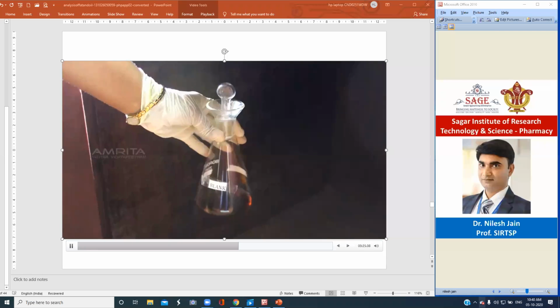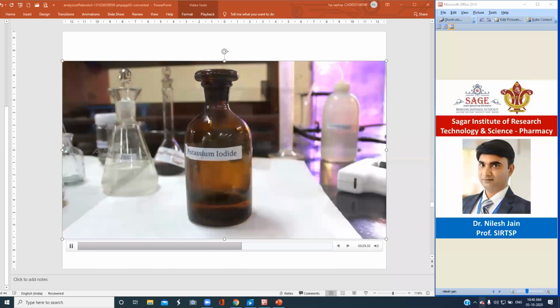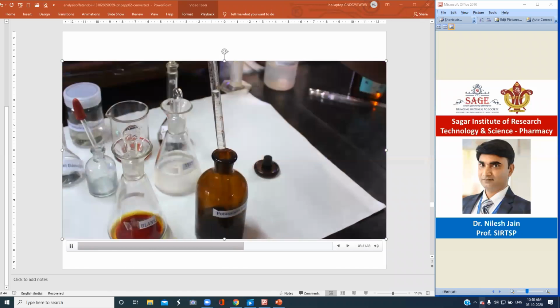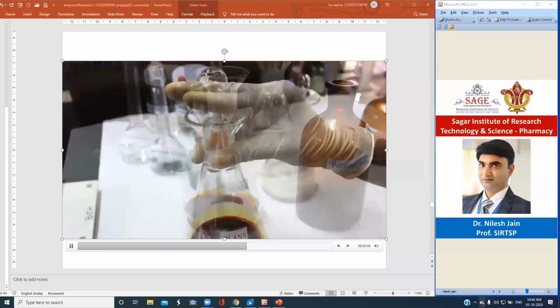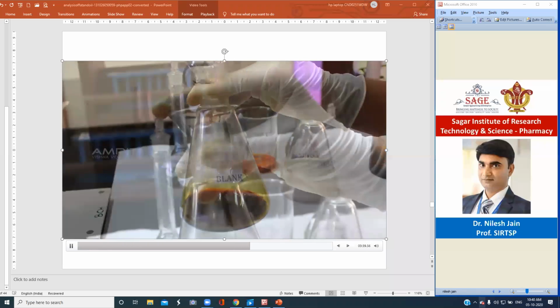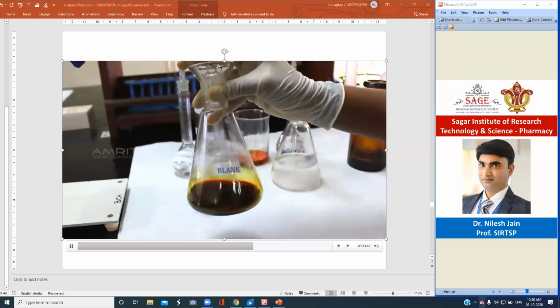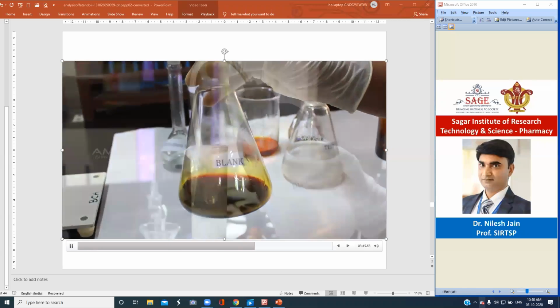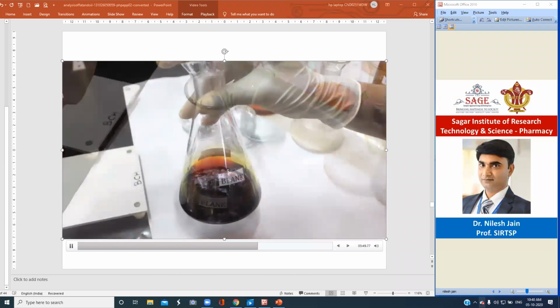The procedure is repeated for the flask labeled blank. Pipette out 10 ml potassium iodide solution into the blank after 30 minutes incubation. Stopper the flask and swirl it to mix the contents well. On mixing, the color of the solution in the iodination flask changes to dark red-brown. Rinse the stopper of the flask with 30 ml distilled water and mix the contents again.